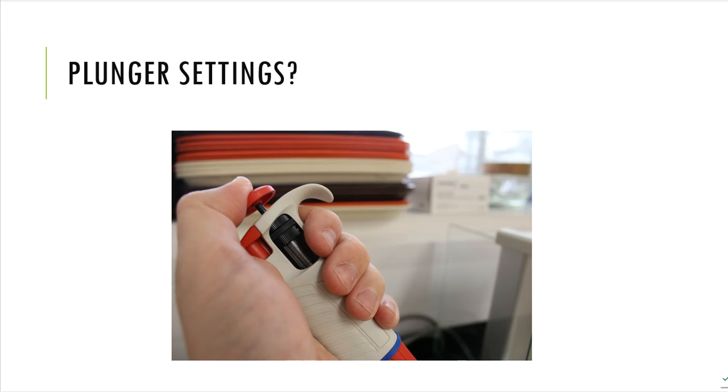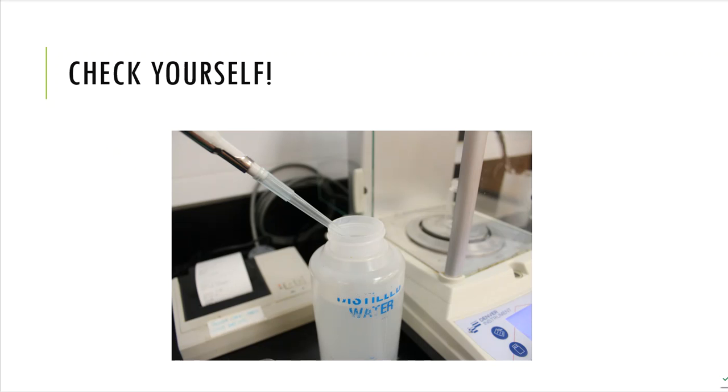There's actually 2 stops. This plunger pushes down to stop number 1. It's pretty forceful. If I slowly push that plunger down, I'm going to stop right there, and I think that's probably as far as it can go. But there's actually a second plunger stop that this micropipettor can be pushed to a little bit more. So with the plunger pushed down to the first stop, I take the tip of the micropipettor and put it down into the water or the sample that I'm trying to suck up, and then I slowly let up on the plunger.